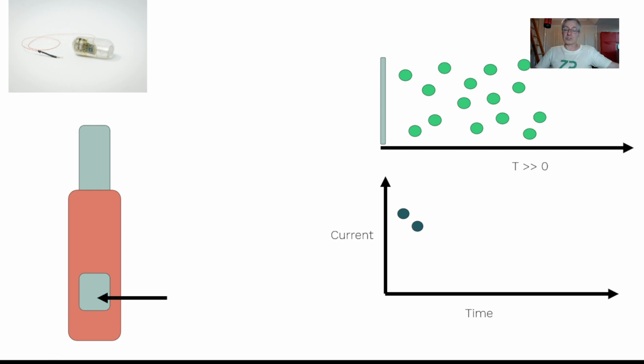What you're doing is consuming the electrochemically active molecule at the surface of the electrode, and it's only got diffusion bringing it in. Diffusion is not necessarily that fast a process. So in fact, you're depleting material, and as material disappears, the current diminishes. This is because we are depleting material.